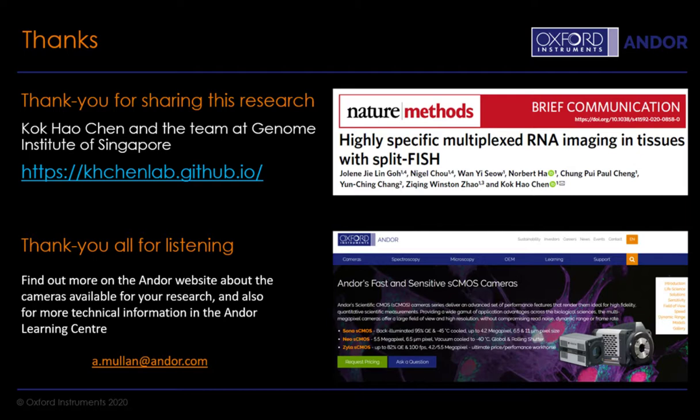I think the main challenge on the FFPE tissue is that many times the RNA in the tissue is degraded, so it will make it very difficult to stain them. Maybe the RNA is very broken down or already has very poor RNA quality. Then it will make the staining very challenging, and also the imaging as well.